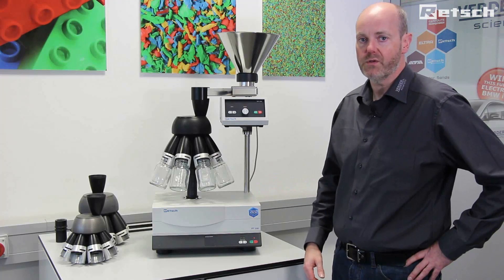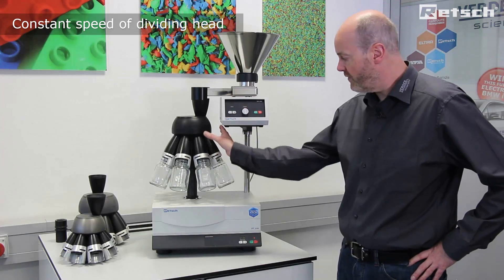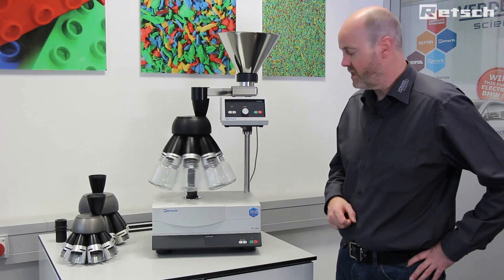Of great importance is the fact that the speed of rotation of the dividing head is constant. It's very important that this is fixed, as we can see here.